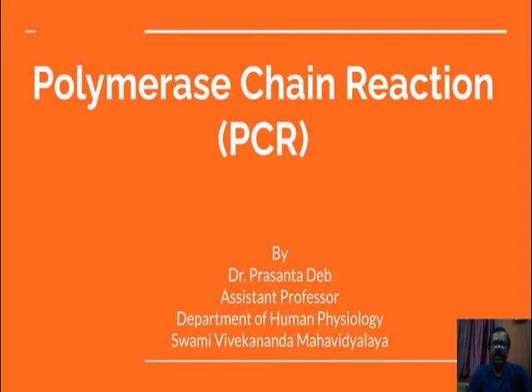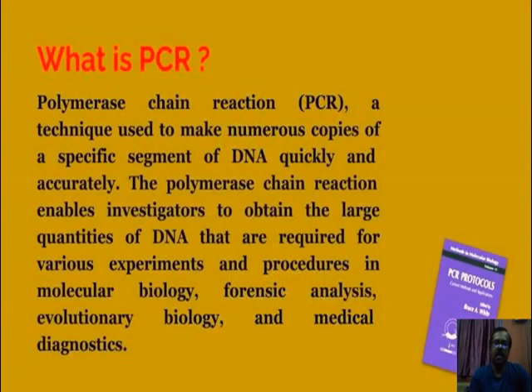Dear students, we are going to discuss an important topic today, which is very much relevant to your syllabus. That is molecular biology. This is known as PCR or polymerase chain reaction. So, what is PCR? Polymerase chain reaction, or PCR, is a technique used to make numerous copies of a specific segment of DNA very quickly and accurately.